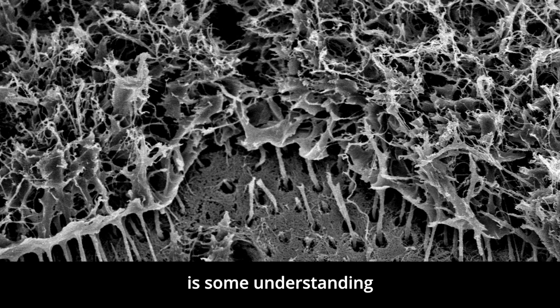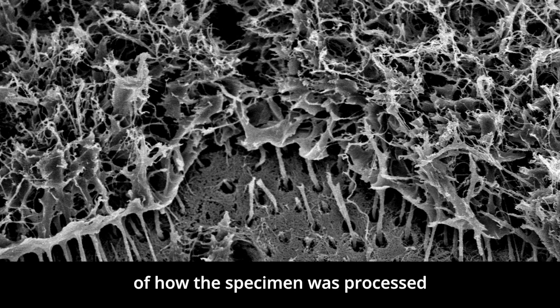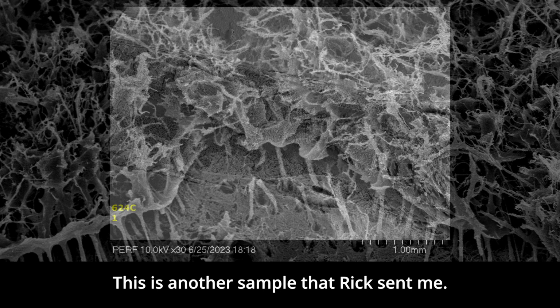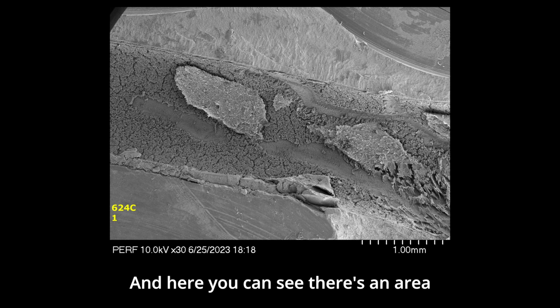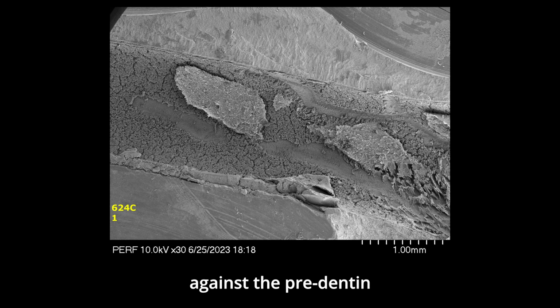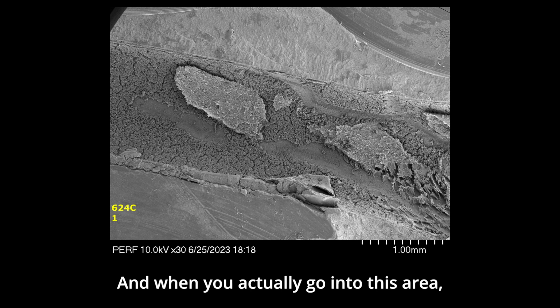So always in your mind is some understanding of how the specimen was processed and what is real and what is artifact. This is another sample that Rick sent me. And here you can see there's an area that looks like a smear layer. Well, that's where my Explorer brushed against the predentin and created a smear layer as I wanted to remove the desiccated pulp out of the tooth.